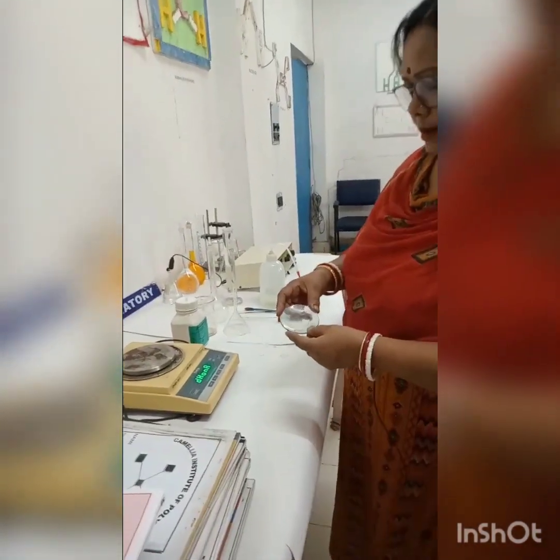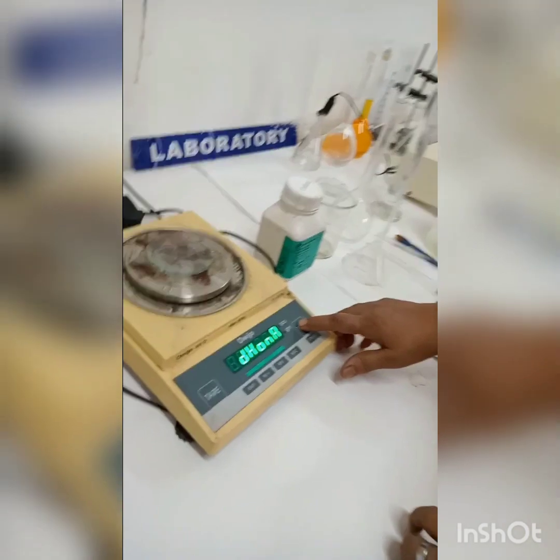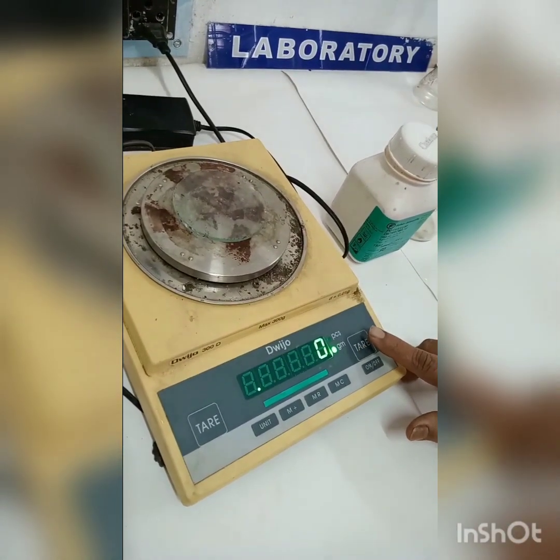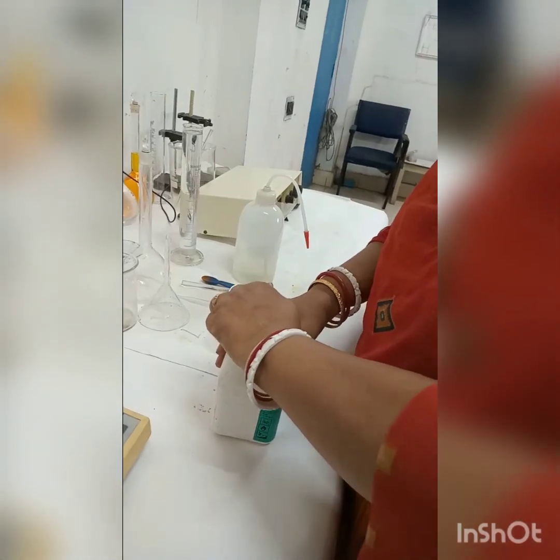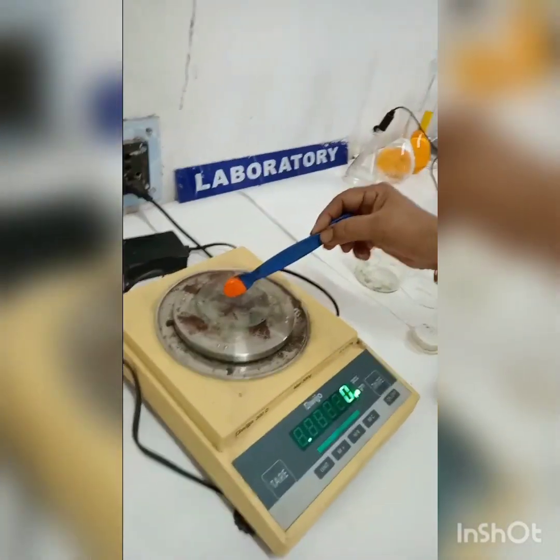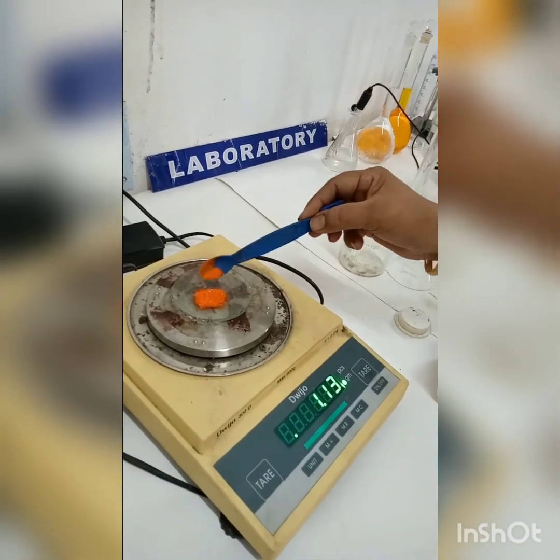At first, take a clean and dry watch glass. Place it on the weighing machine and set its reading to zero. After that, weigh 1.225 grams of potassium dichromate crystals.